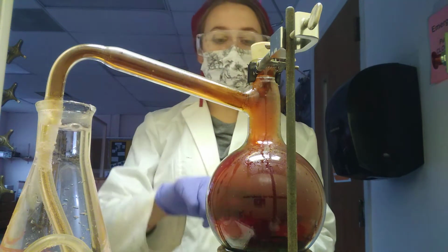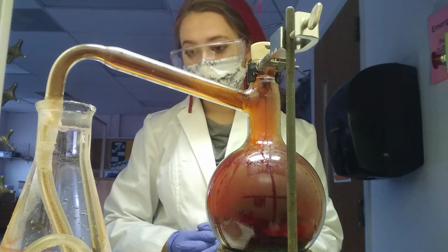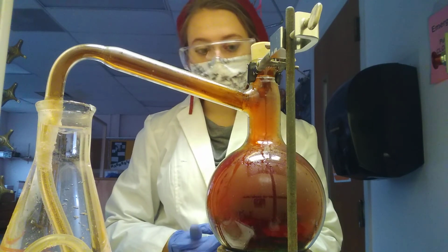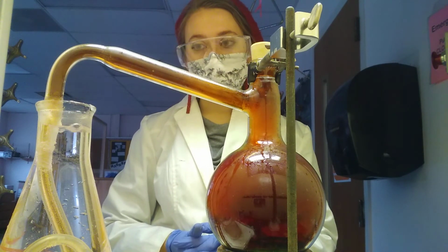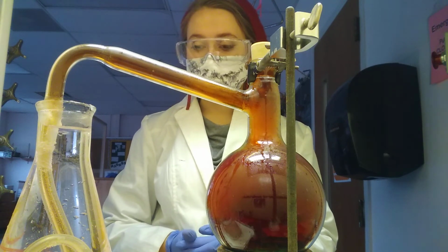You can see the nitrogen dioxide has gone all the way down in through the tube. It's slowly working its way all the way through. And at the end, we're going to see what has happened to the copper.